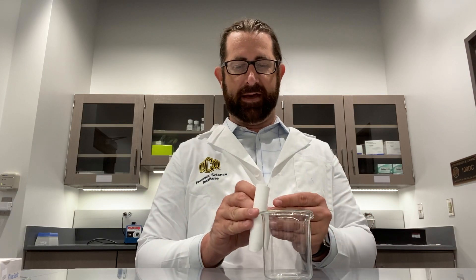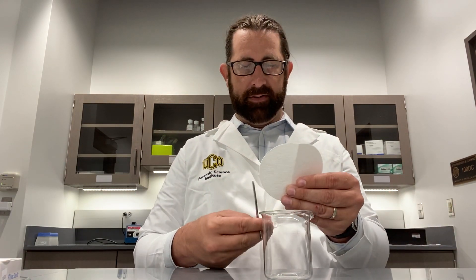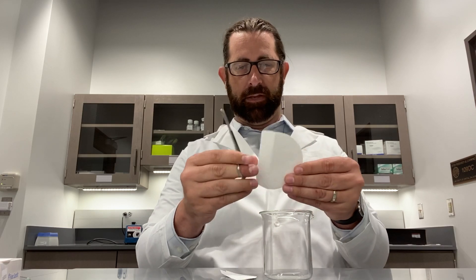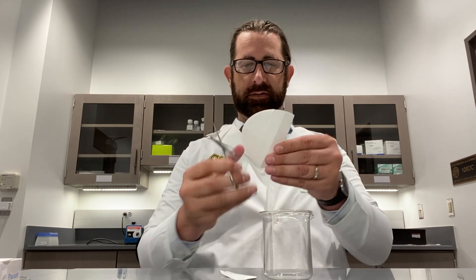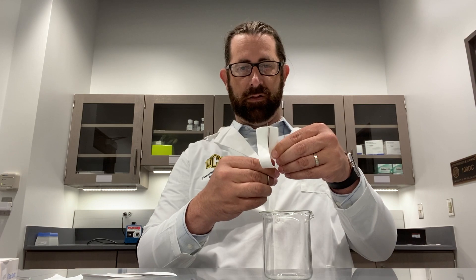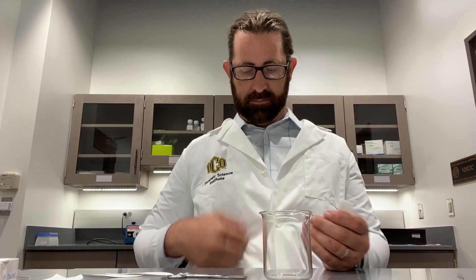It looks like the height of this filter paper is about the same as the container — if I were to overlap this, it would be about the same. So what I'm going to do here is fold this in half. It may be different for you, so don't think this is the only way. I'm going to cut right down the center on this filter paper, do the same thing on this side, and then cut this right down the center as well. Now I have four pieces of this filter paper.